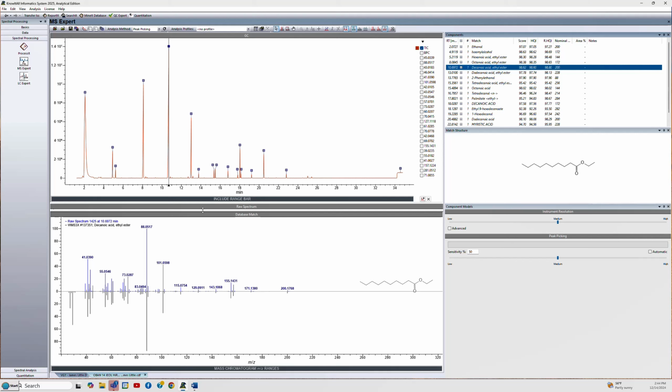And remember from the other video, I set up the window over here under View to look at this structure here in the pane. It's just better because sometimes it overlaps down here. So this is just a better way to view it. So that's already done. We ought to make sure that the settings are correct.